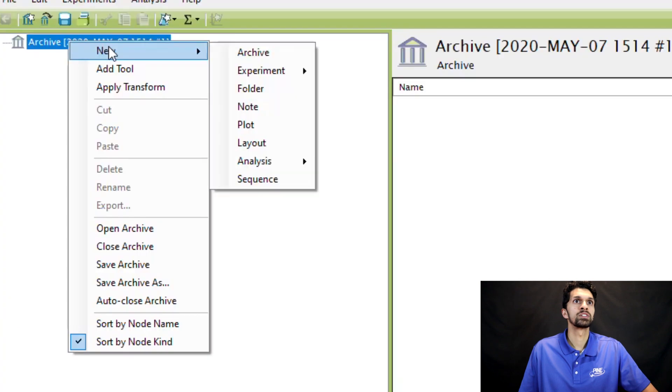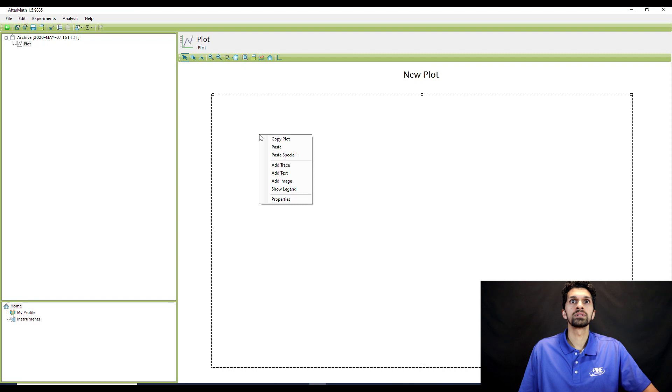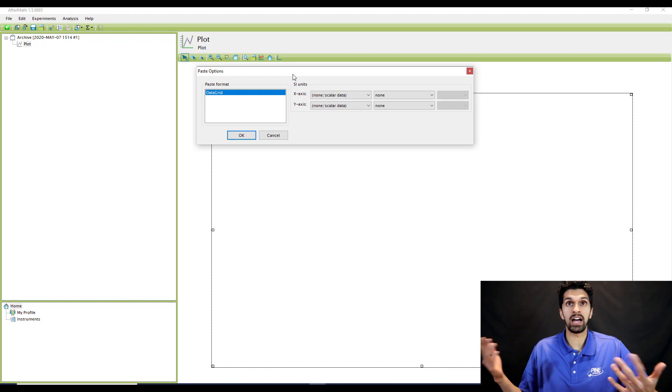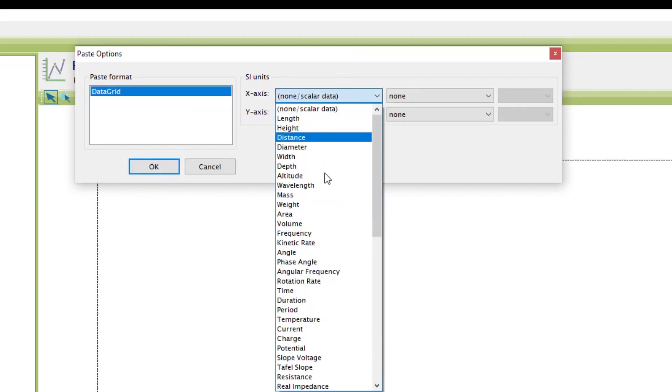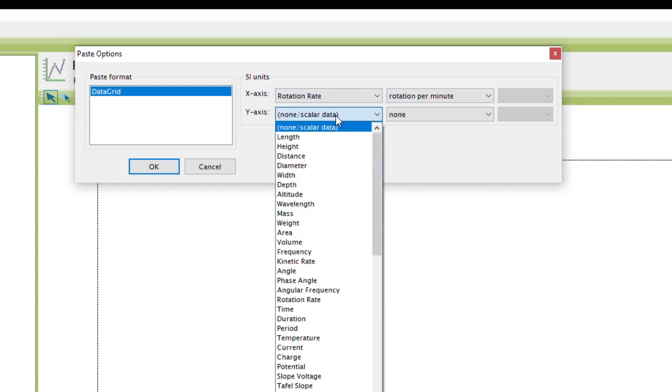I'm going to right click, go to new, create a new plot. Right click, and then I'm going to paste. So the data points that I have in Excel have no units, but I can assign units to them when I paste it into Aftermath. So the x-axis data is the rotation rate. So let me just click on rotation rate, and that's in units of rotations per minute.